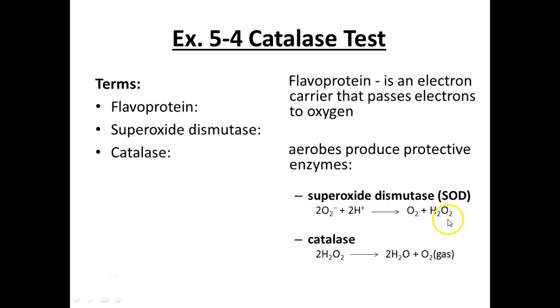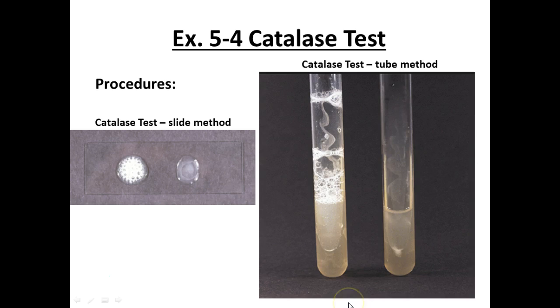So the next step is what? Catalase. Catalase converts the hydrogen peroxide into water and gaseous oxygen. So hence you see what? Bubbles, bubbles, bubbles.